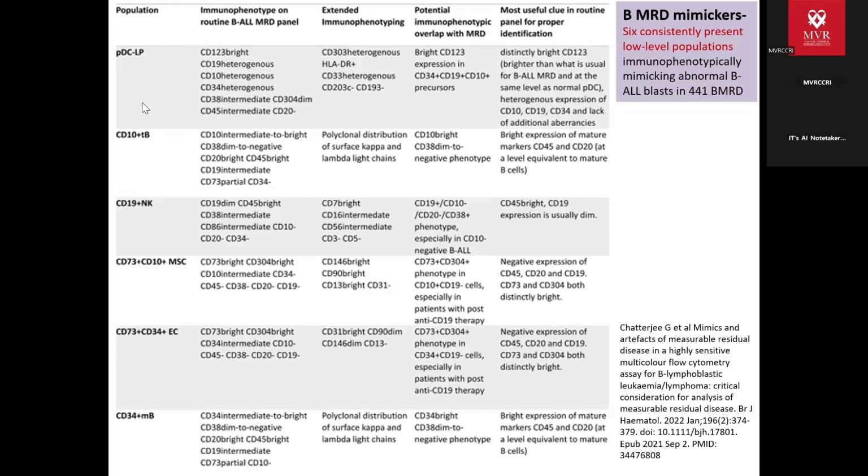If you see here the MRD, when I analyze 64 lakhs or 6 million, the MRD events are 19. When it comes to 5 lakh, events become 2. When it comes to 10 lakh, it comes to 3. And 3 and 2 I'm not supposed to report because my limit of detection is 14. Here it is coming above my limit of detection, so I can still report this as MRD positivity. That is the importance of the number of events acquired in an MRD.